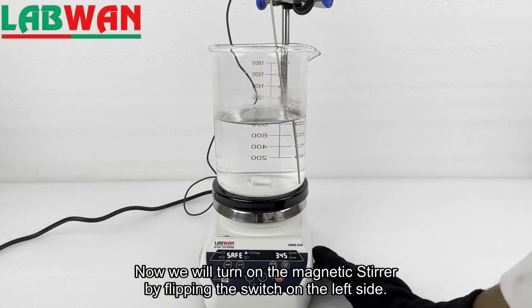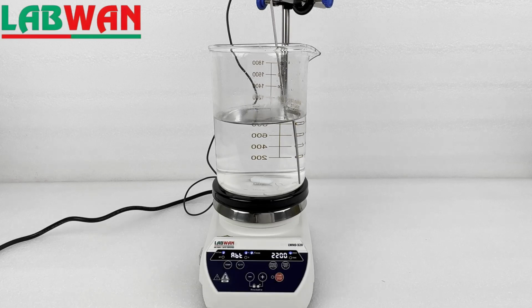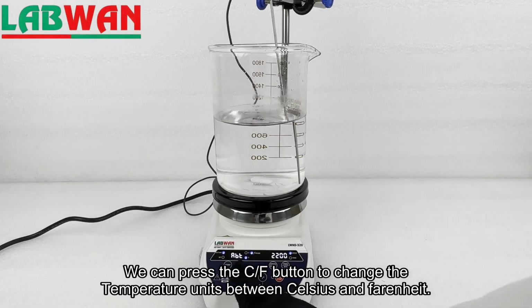Now we will turn on the magnetic stirrer by flipping the switch on the left side. We can press the C/F button to change the temperature units between Celsius and Fahrenheit.